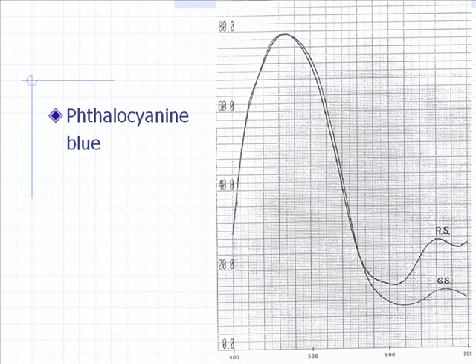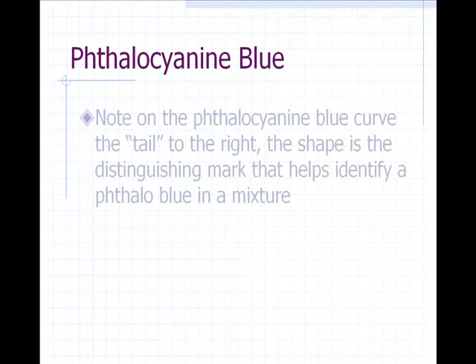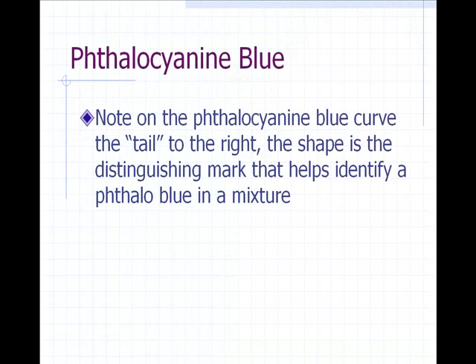We have made up some colorants and some curves, and you get a very distinctive curve when you get phthalo blue contamination. In later classes you'll see this. You can actually use the curves to determine if you have some leftover phthalo blue in there. Okay, phthalo blue is very distinctive.